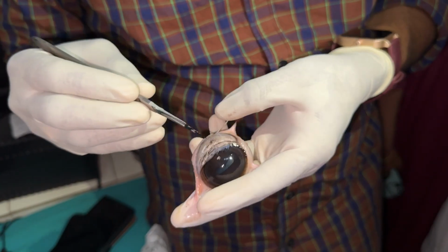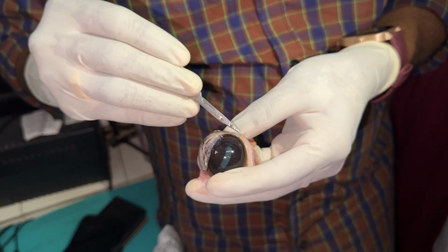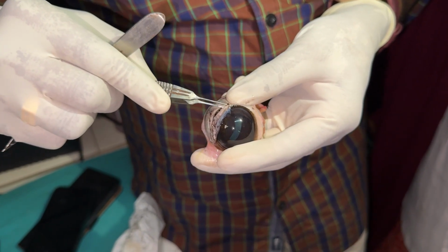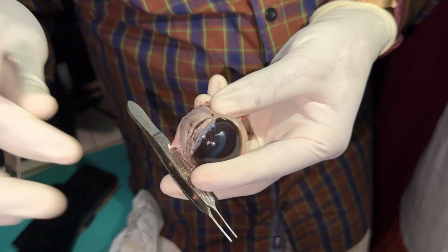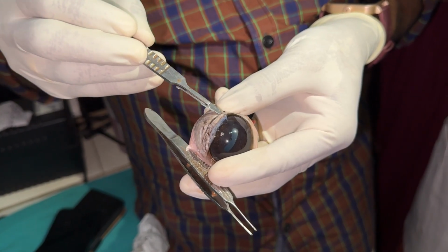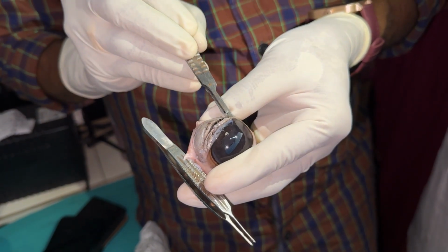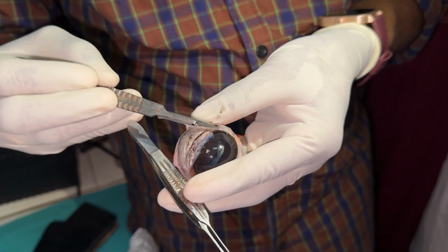Take out the cornea. The aqueous humor is coming out.